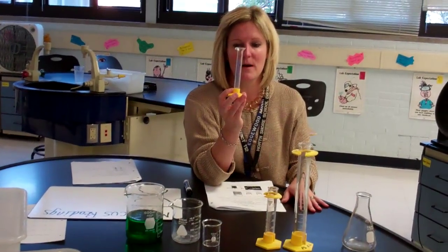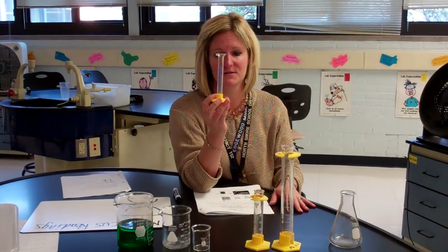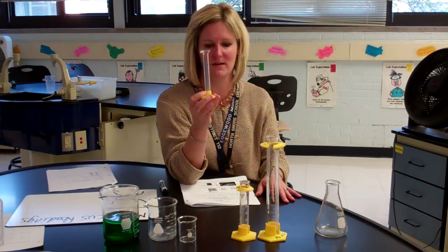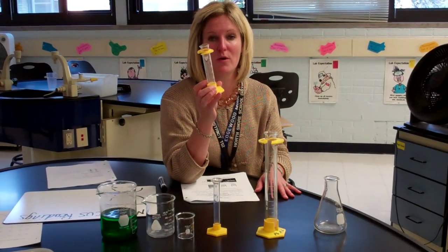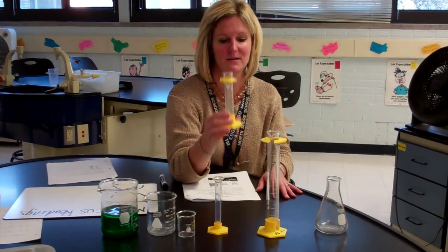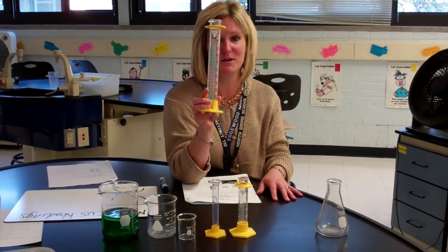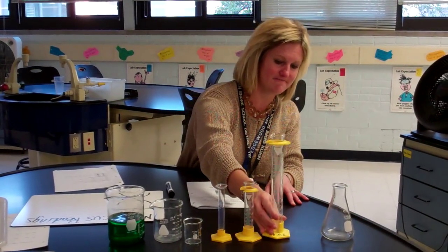Each line on here represents 0.2 milliliters going up to 10 milliliters. So 0.2, 0.4, 0.6, 0.8, and 1 milliliter. Each line on here represents 0.5 milliliters. So we have 10, 10.5, 11, 11.5 milliliters. And then each line on here represents 1 milliliter. It's really important that you know what each line represents so you get an accurate measurement.